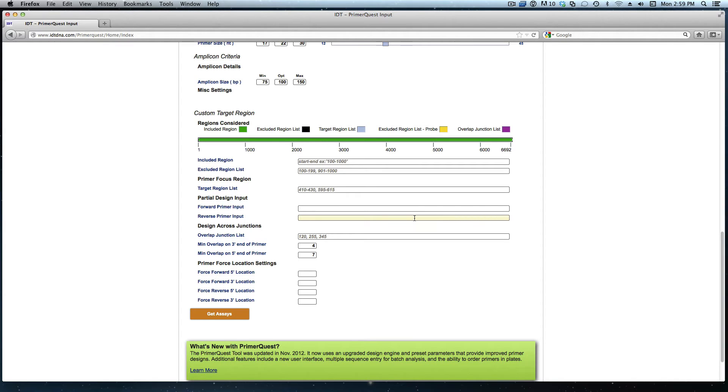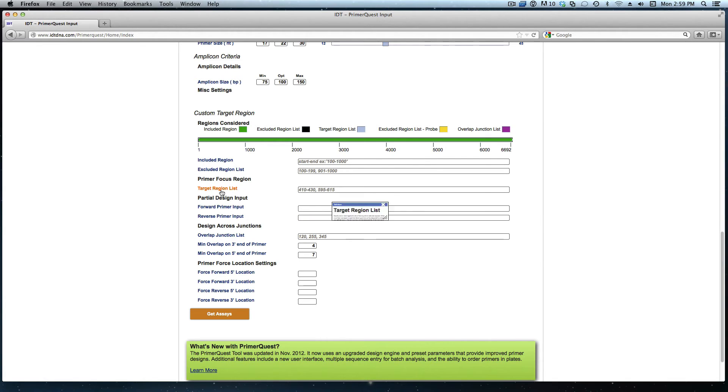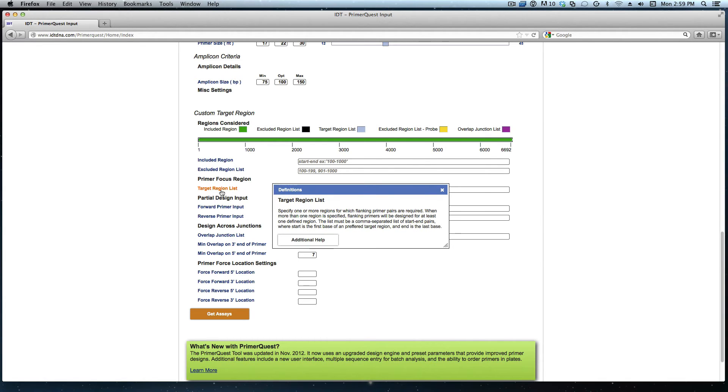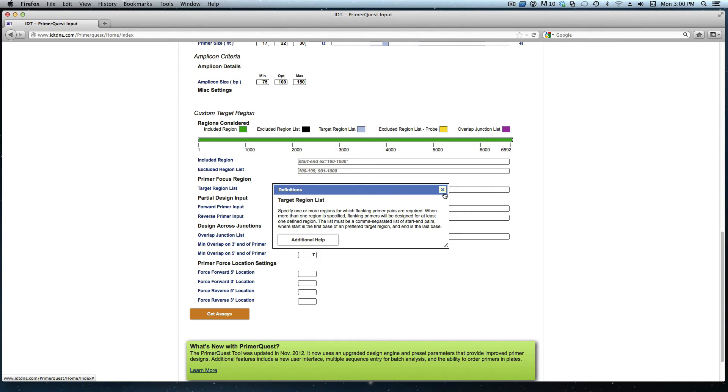As I mentioned I want primers to flank a specified region. The tool recognizes this as a target region. If you ever have questions on what any of the parameters mean you can click on one of these boxes and it will give the definition. A target region specifies a region for which flanking primer pairs are required.